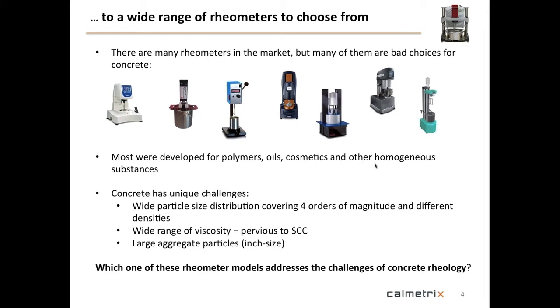So most of those paste rheometers, all of those paste rheometers that people use that were originally made for polymers and resins and oils and things of that type that are homogeneous fluids, all these are very ill adapted for the cement and concrete industry. Still, a lot of research centers, a lot of people buy those and make tests with paste and do rheology or rheometry on paste.